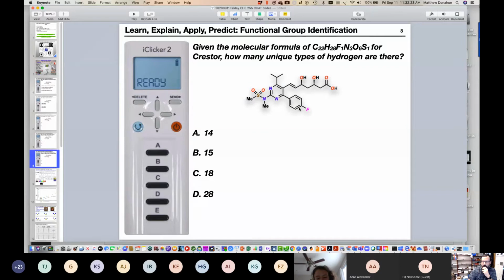That's 6. So Blakely, I was asking, there's 6 carbon atoms. 2 of them do not have hydrogens. The remaining 4 do. So there's 4 total hydrogens, but how many sets are there? It ends up being 2 because these are the same and those are the same. So we're up to 6 now.